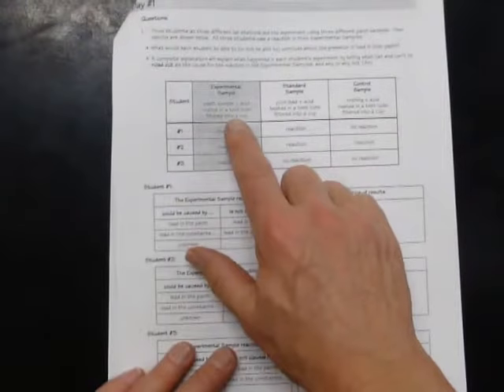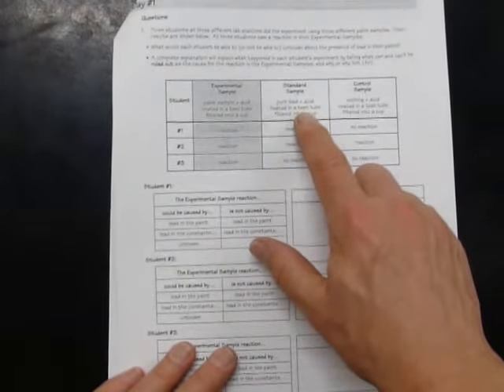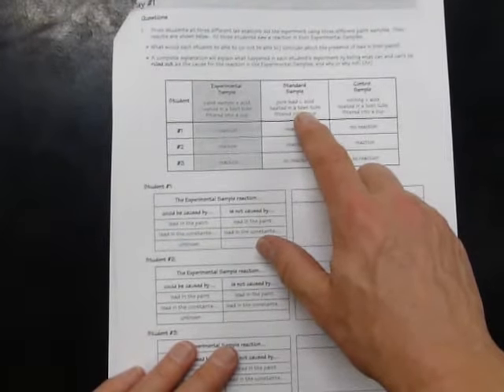So the question is about 3 different students who did the same experiment that you did. They set up an experimental sample with a sample of paint in it. They put some lead into a test tube to make a standard, and they left one sample without anything added to it to make the control.